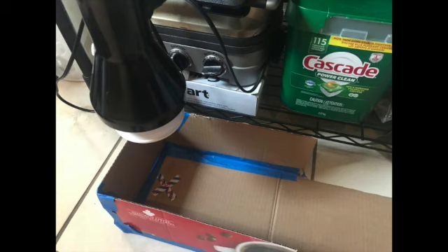So in this lab, I wanted to study how the effects of light stimulus affects how far a worm might travel from a specific point. So this over here is the setup of the lab. I had the light over the X where I put the worm, and I put the little box around the cardboard so the worm would only want to travel in one direction, away from the light.